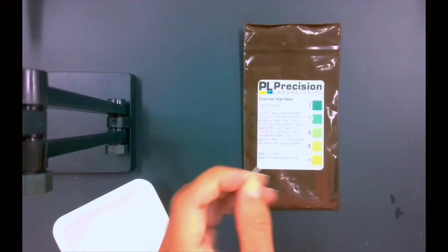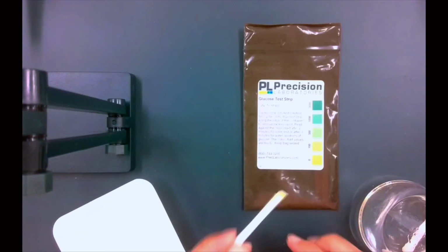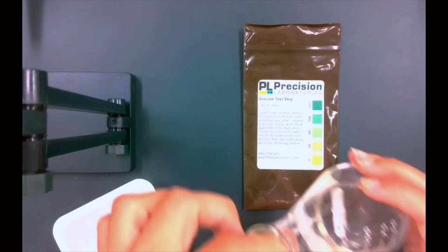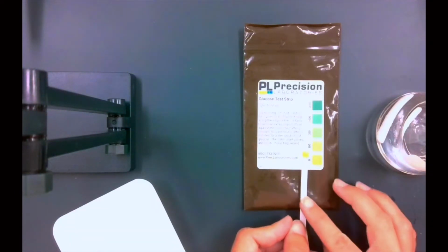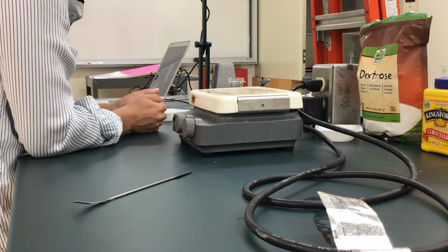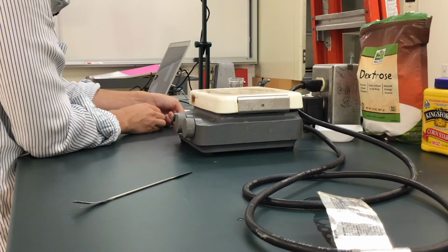Here is one of the test strips. It's just a plastic strip with a sort of litmus test at the end, which will change colors depending on what our solution is. And dip it in and pull it out. I'm going to wait a few minutes while it saturates the testing strip to see exactly how dark it's going to get. The test is usually about 3 minutes for water-based solutions.